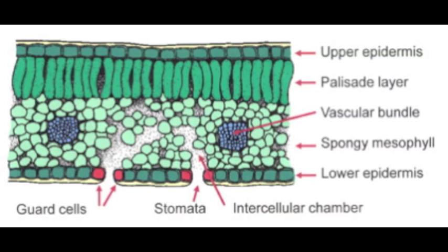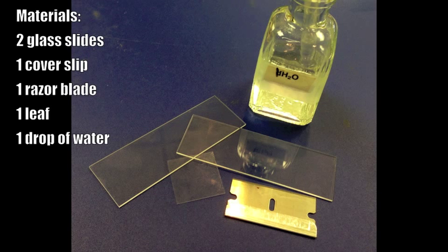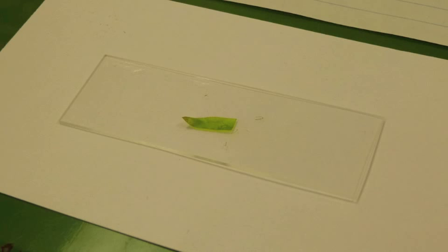We will be viewing the different structures of a leaf cross-section under a compound microscope. Place your leaf on one slide and add a small drop of water. Place the other glass slide on top of the leaf, leaving a portion of the leaf exposed for cutting.